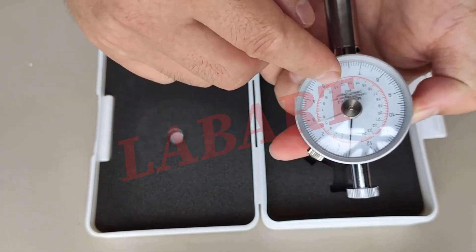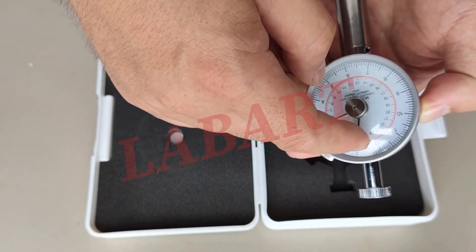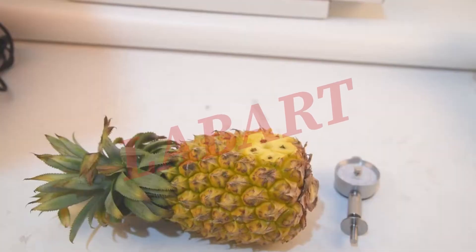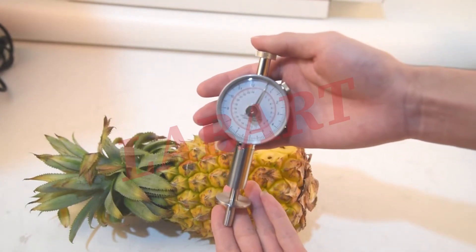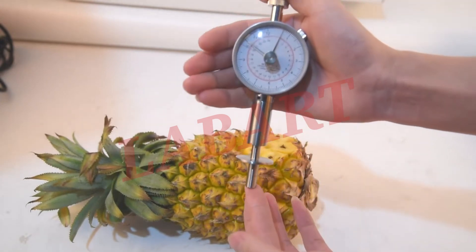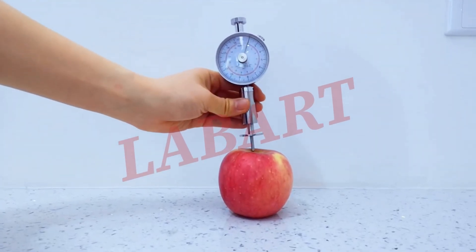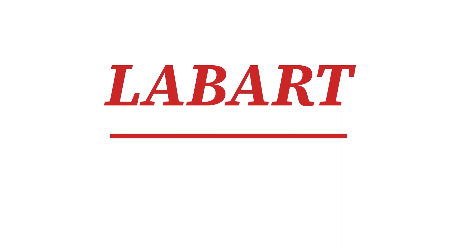Okay. The indicator needle shows us the exact readings, because it gets pushed to the place where we stop the testing. So this reading is the hardness of the fruit. This is the meaning of the hardness reading.